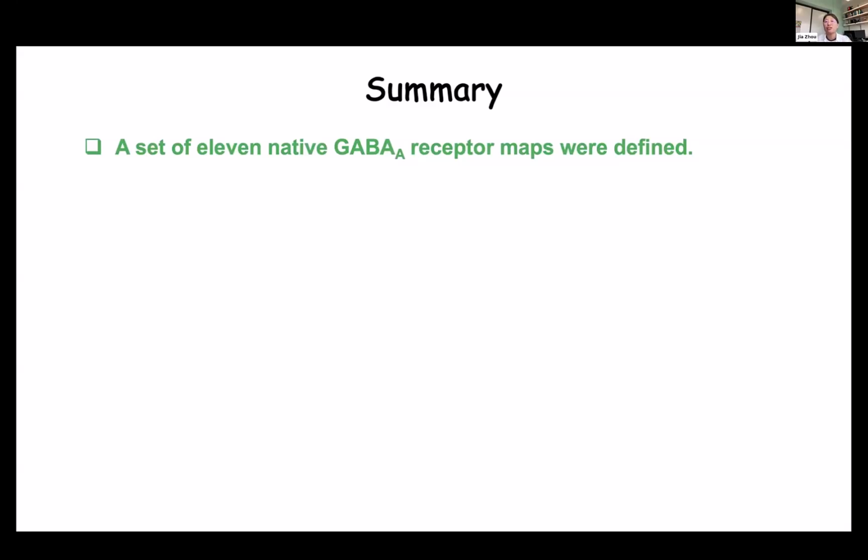For the people who don't know GABA receptor, we mainly see alpha, beta, gamma. They have different sizes of N-glycosylation and a different number of N-glycans. So that's the first way we determine alpha, beta, and gamma. But I'm not totally sure how to use the N-glycosylation to tell where it's coming from, like which cell type. I didn't have that kind of information. But based on our resolution, we can indeed tell the glycosylation.